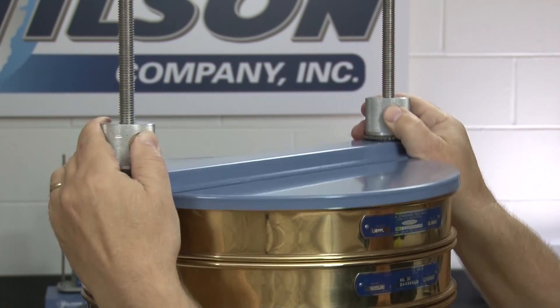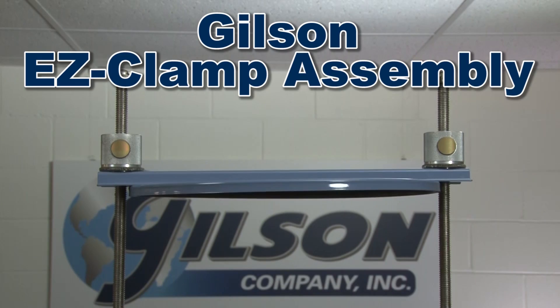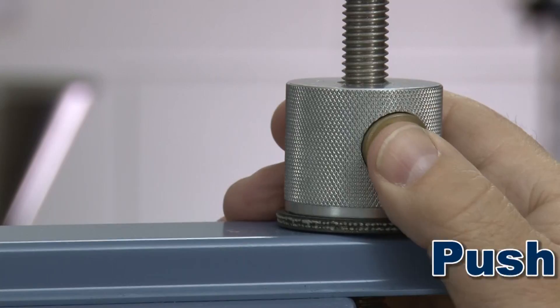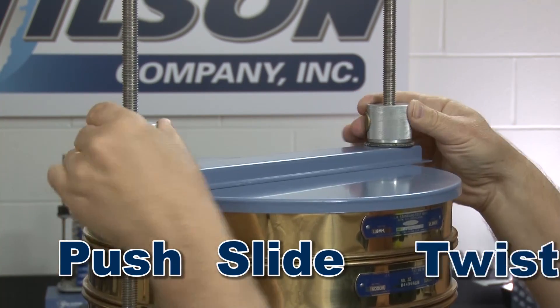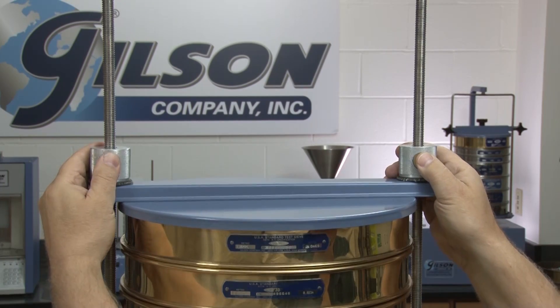Securing the sieves is as easy as pushing a button. Gilson's new EZ-Clamp system effortlessly slides up and down with no cumbersome knobs to work with. To secure the sieve stack, simply push the release button, slide the clamp assembly down to the sieves, release the button, and twist to tighten. And to release, simply push the button and lift.